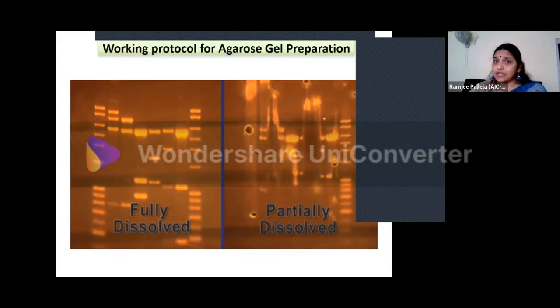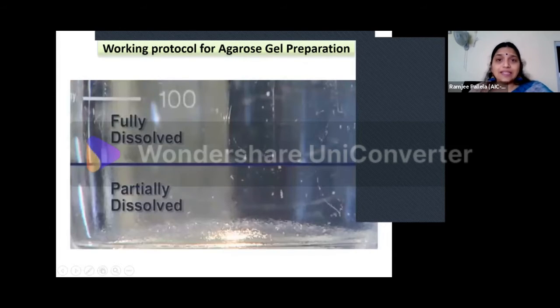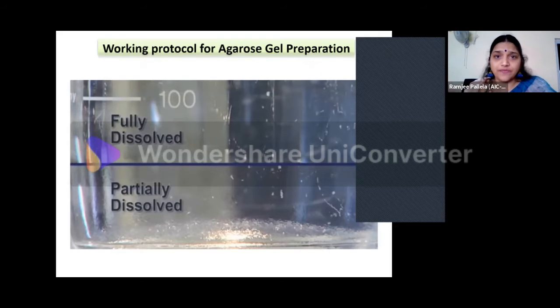I generally do it in a conical flask. Okay, and when you are mixing it, you have to be very proper, very thorough, and like it showed, I'll just show you again. You see here, if you see like this, heat it a little bit more or mix it a little bit more. Okay, but be very careful, don't try to mix it with your bare hand or with only little latex gloves. Don't do like that. Okay, wear silicone gloves or wear the microwave safe gloves.